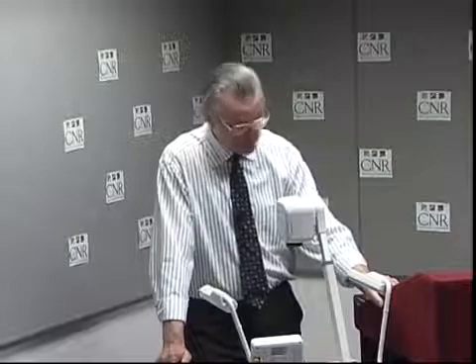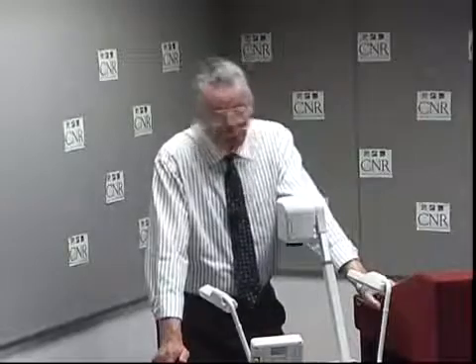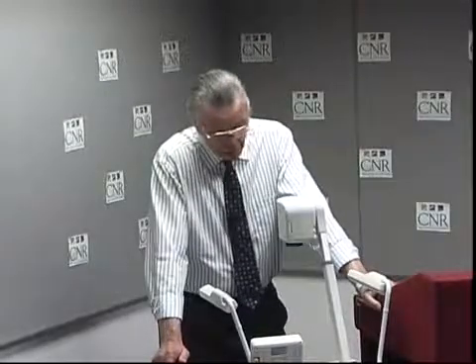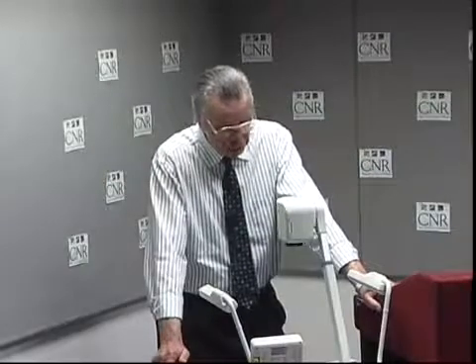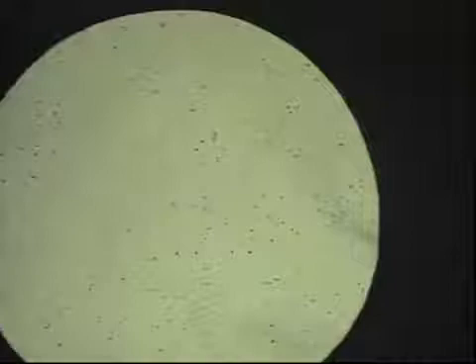So when the mill producing the recycled fiber that has been cleaned will test to 563, or some other method of quantifying the amount of dirt that is present, and certify to the buyer that in fact the stock is to the standard. This hand sheet that you see here is used in process control.